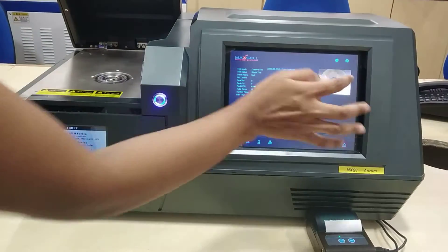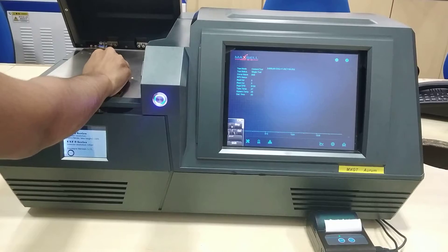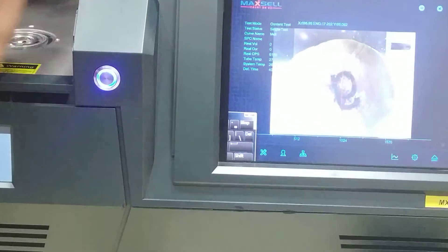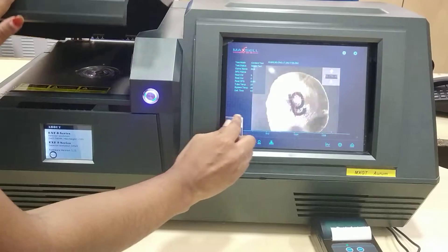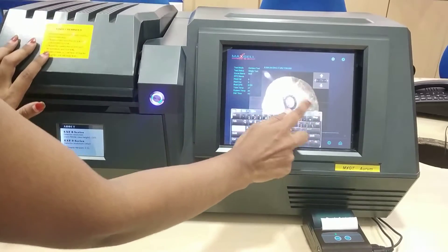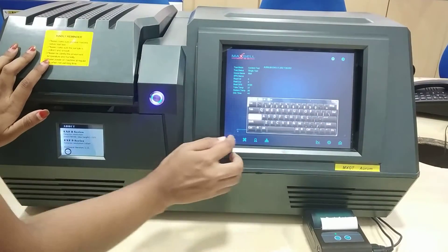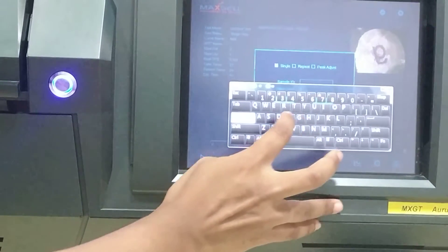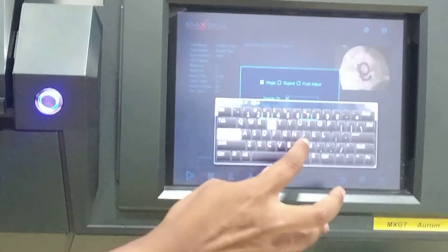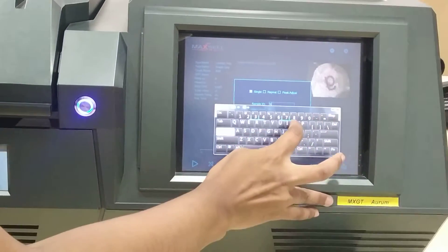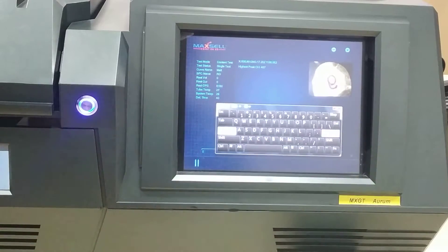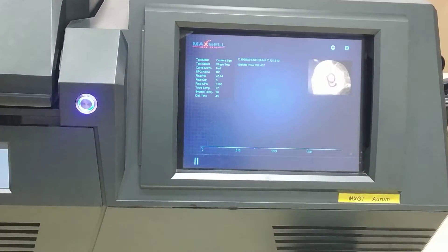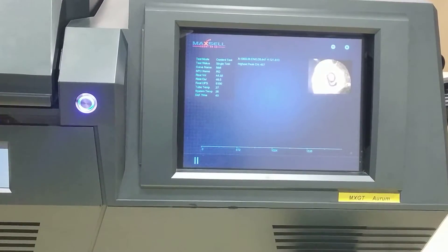Here you have a zoom option — you can zoom in. Place the sample, zoom out, and you can give it a random name like 'RO' or something, and then the test begins.